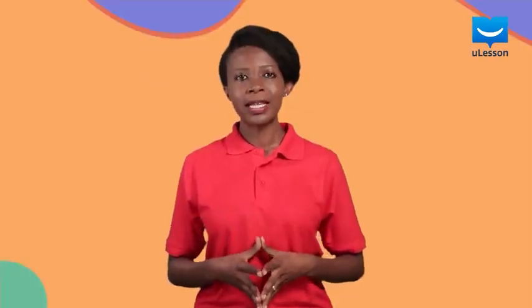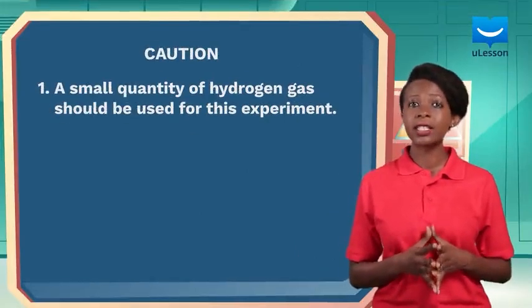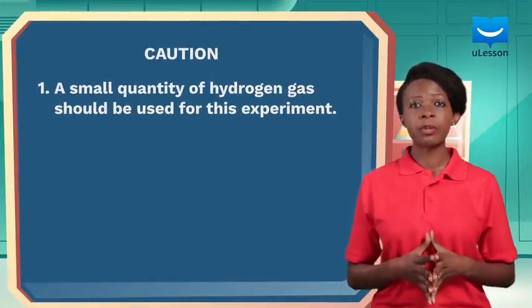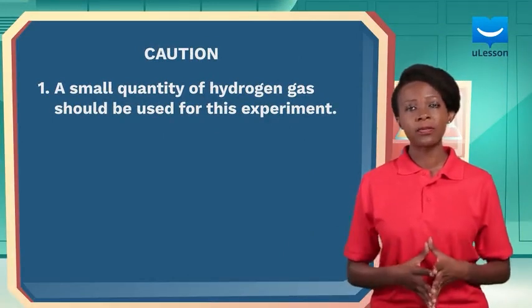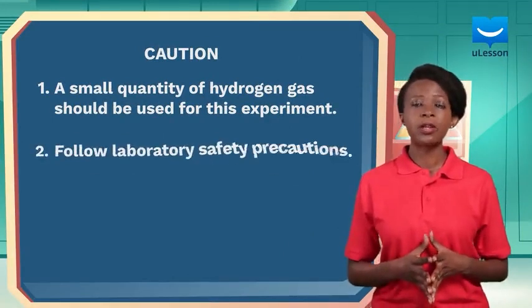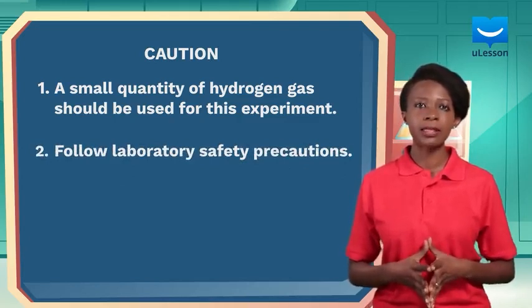Before we conclude this lesson, it is very important to note that a small quantity of hydrogen gas should be used for this experiment because a mixture of hydrogen and air is explosive. Also ensure that you follow laboratory safety precautions before carrying out this experiment.